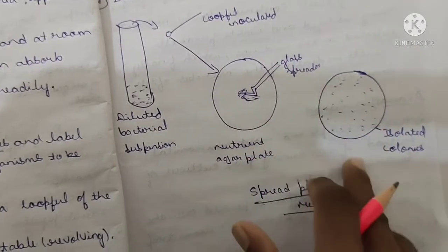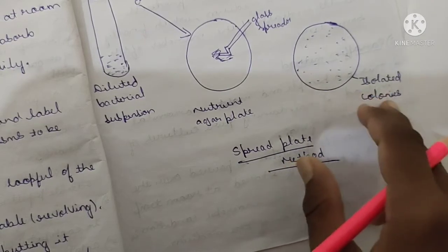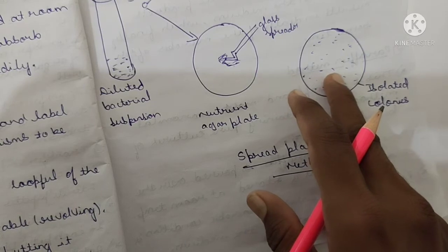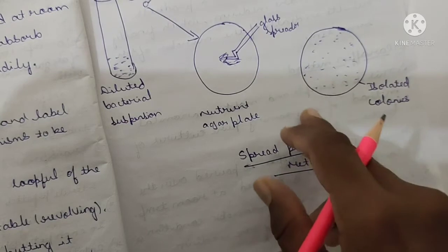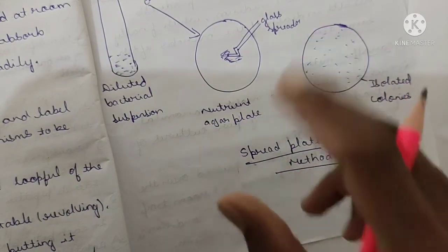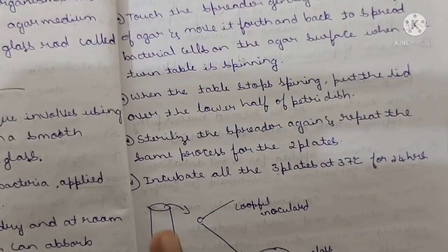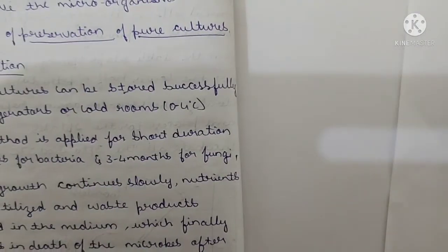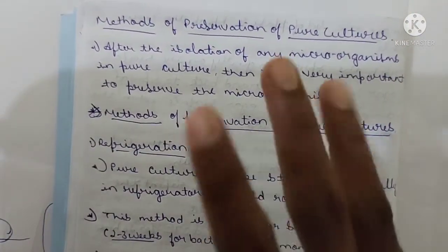This type of figure you can observe here. See, isolated colonies, separated colonies. While you observe under the microscope or any other type of microscopy, you can easily observe these minute isolated colonies on your Petri plates, agar plates. Yes, my dear brothers and sisters, these are the three important methods for pure culture. Got it? And these are very important, that's why I have explained only these three.